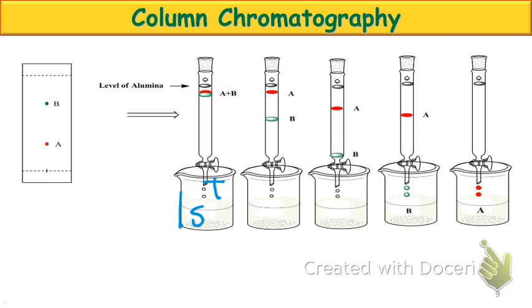So if we now put our compound in behind it, our compound's now shifting around physically with the silica, not just interacting with the silica gel on its own through the intermolecular forces, which means we've created an inconsistency. Our whole goal is to make sure it's as consistent and smooth running as possible. Okay? If we've got air in there, it's not going to run smoothly. So our very first job is to make sure that that column is as consistent and even as possible. We're going to load it with as much solvent as we can so that it's all nice and wet, nice and evenly packed, hopefully no air inside it. Okay? We can then load our compound onto it.